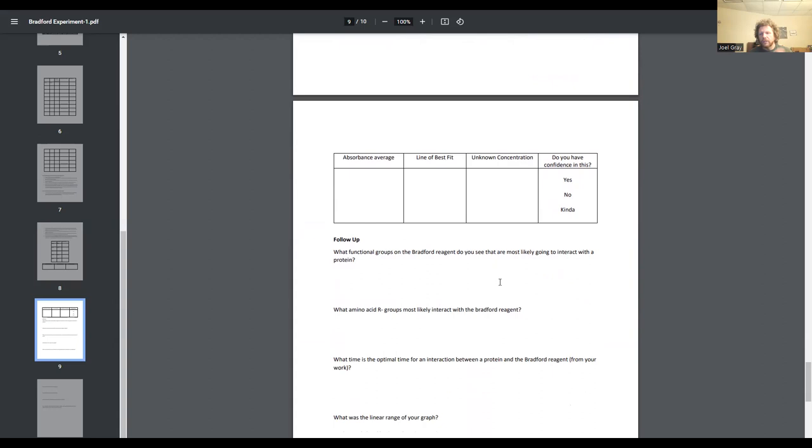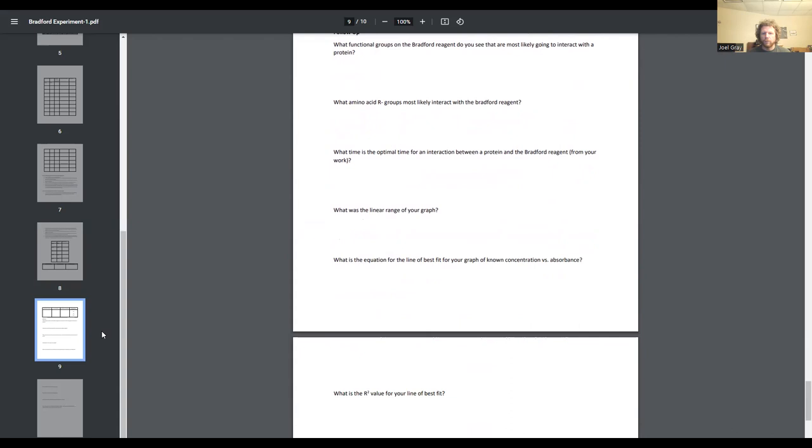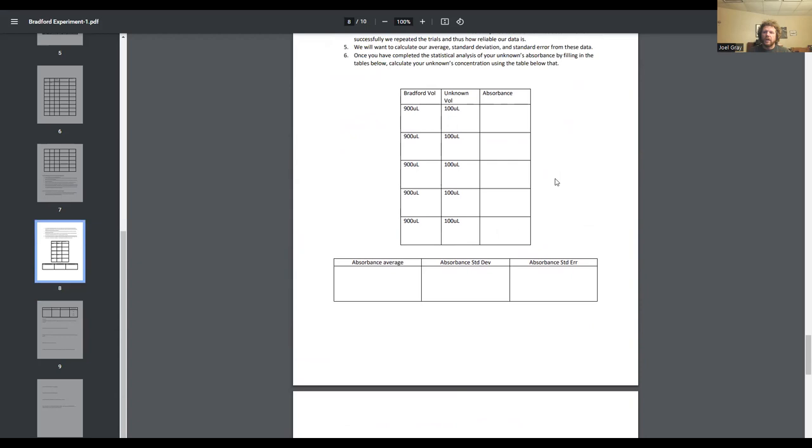Then there's some follow-up questions here that ask you to just think about the Bradford reagent, look at that molecule, look at your data. And that's one thing that I want you to take away from this. The data that you put together, the conclusion of your unknown, well, that is yours because you made all the samples.